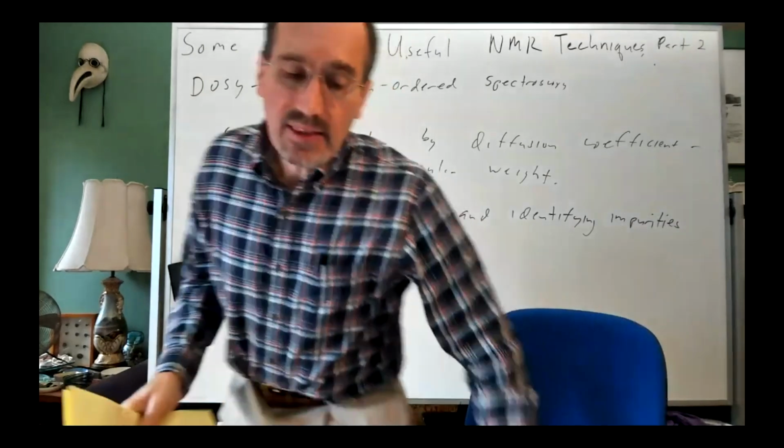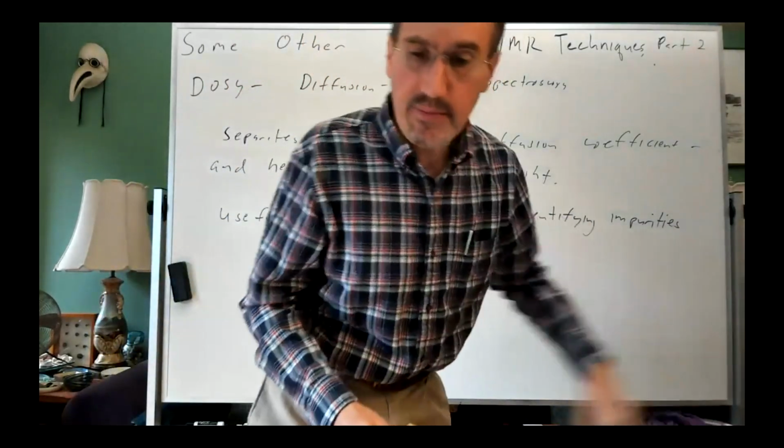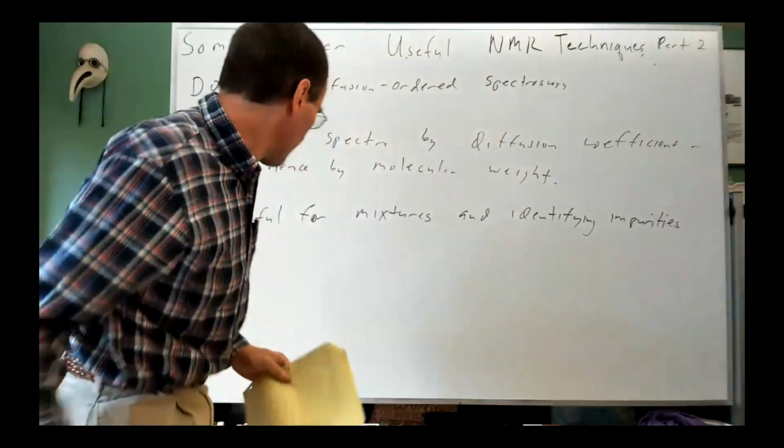All right, I think the last technique I want to talk about here is water suppression.